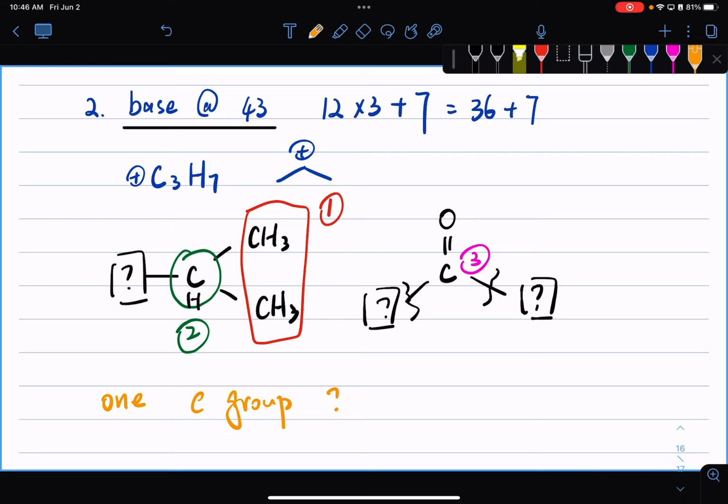Now let's look at our proton NMR. My proton NMR is quite interesting. This doublet and the heptet correspond to what we already know: my isopropyl group. The green one is our heptet, because it has 6 neighboring hydrogens. The CH3 and CH have a ratio of 1 to 6, which clearly shows they come from my isopropyl group.